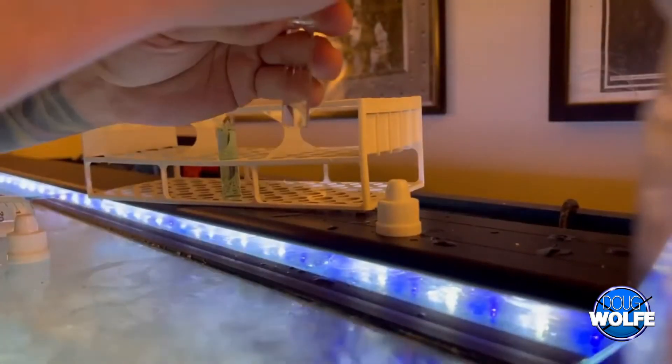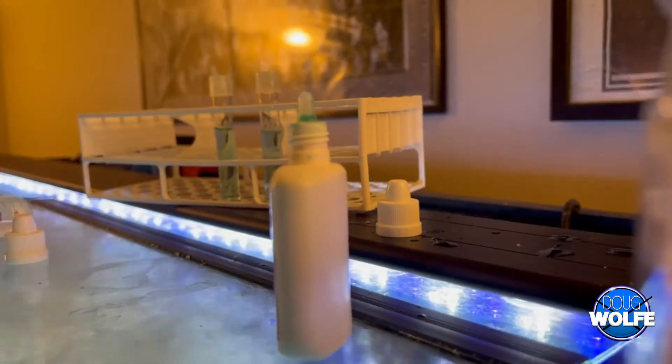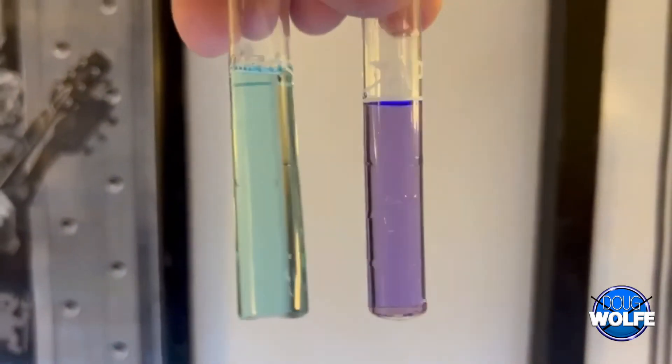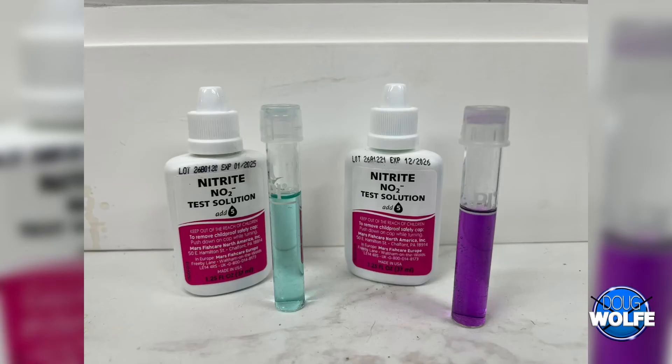You can see here, I'm doing the test. This is sped up because no one wants to watch five minutes of nothing. Correct amount of drops, tubes were rinsed with RO water, the time was done correctly. Everything that you could do — and this is tested at the same time, same tank, same water — two different results. See for yourself.